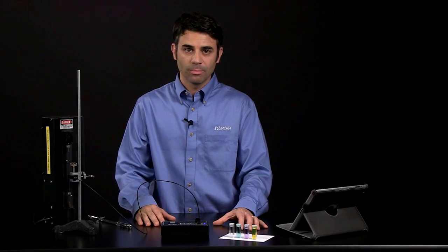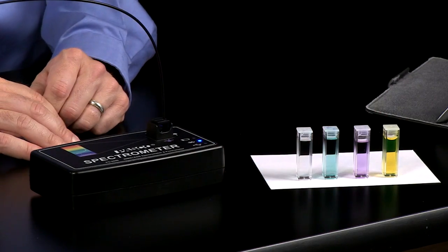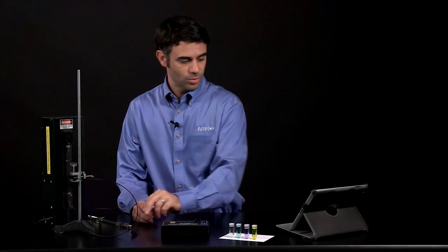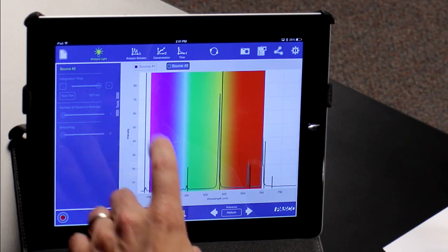The other common use for the spectrometer is going to be to analyze solutions, colored solutions like we have here. So the first thing we're going to do is go to the analyze solution page so we can get a full spectrum of a colored solution.